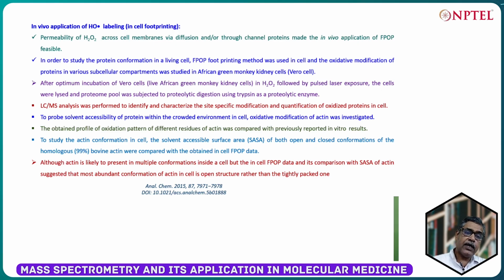Now, after optimum incubation of Vero cell, live Vero cell we are talking about, in H2O2, followed by pulsed laser exposure, the cells were lysed and the proteome pool was subjected to proteolytic digestion using trypsin as the proteolytic enzyme. Now, next is the bottom-up proteomics approach. So, nano LC-MS or LC-MS analysis was performed to identify and characterize site-specific modification and quantification of oxidized protein in the cell.